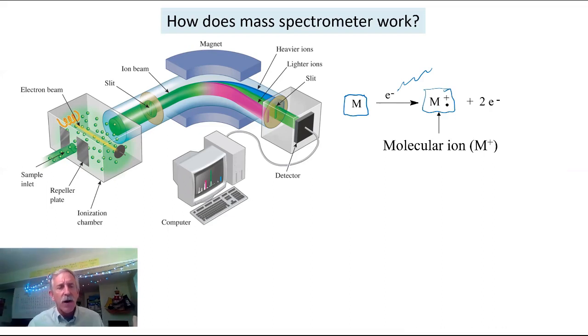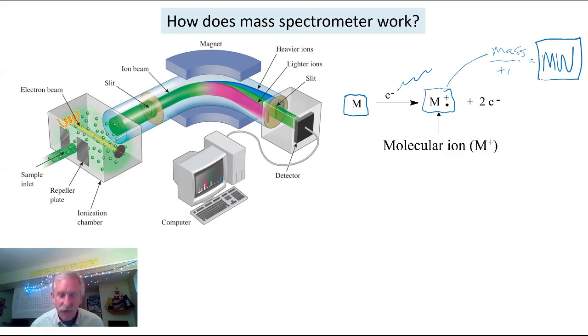So there are a few molecules that can get through our instrument that only have one electron ripped off of them, and therefore the whole molecule is still there, and we can measure its mass. And if its charge is +1, because it just had one electron ripped off of it, then really what you're measuring is its molecular weight, because an electron doesn't weigh anything. So this is the most important piece of information that a mass spectrometer will be able to give you. A mass spectrum, or an MS, is what we abbreviate it as. The data that is most critical to you will be the molecular weight.